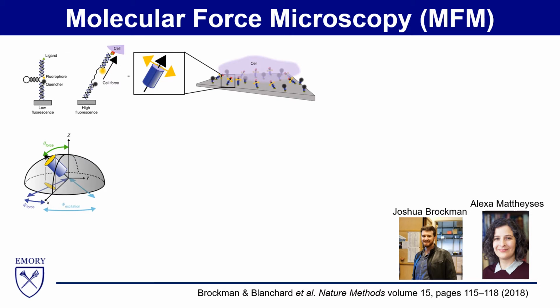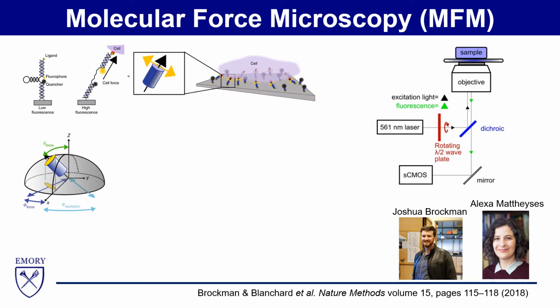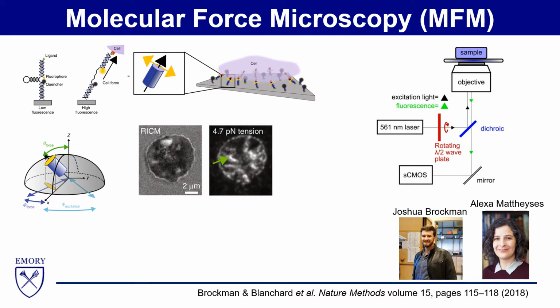To perform these measurements, we implemented a half-wave plate mounted in a rotatable actuator into the light path of our excitation laser beam, which is linearly polarized to begin with. A half-wave plate rotates the angle of linearly polarized light, and so this allows us to fully rotate the electric field vector within the xy plane. We used this setup to image our tension probe samples several times with different electric field angles. In total, we used 73 different polarization angles, and the entire acquisition took roughly 3.5 seconds.